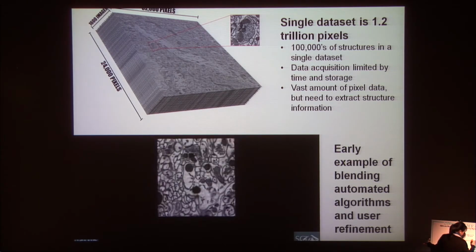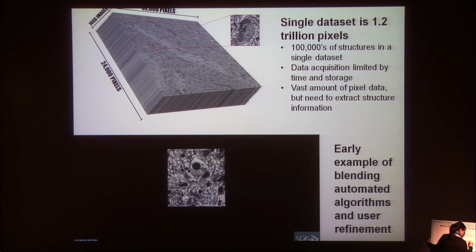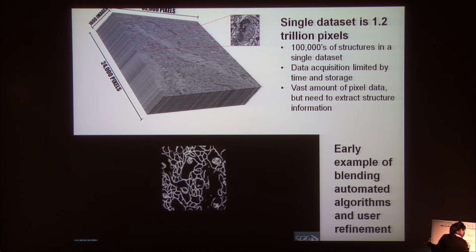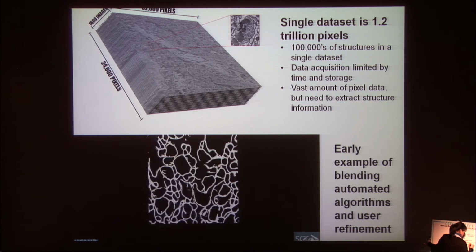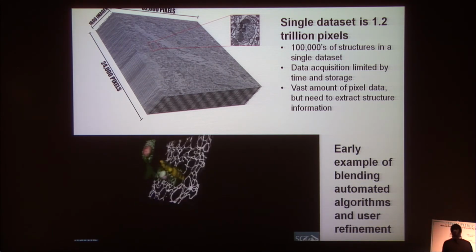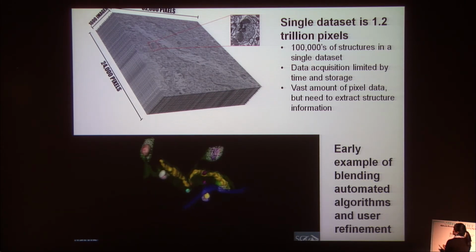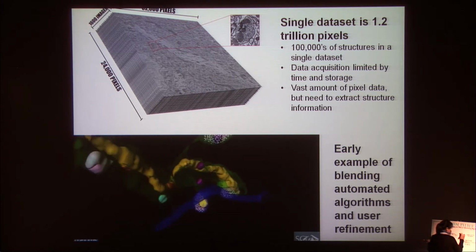Now, as data is growing very massive, manual segmentation is, of course, becoming a very prohibitive bottleneck. So our strategy is really to take leading algorithms and techniques for automatic segmentation and throw those at high-performance computing resources, and then marry that to a crowdsourcing strategy that allows us to scale our ability to go back and edit and curate the results of those computations.